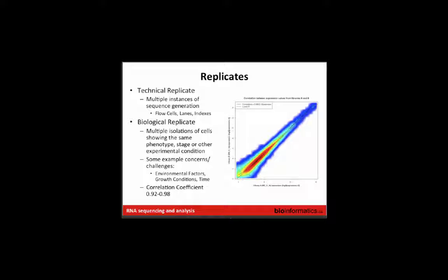Basically you have a piece of instrument data that is at most one lane or a part of a lane if there was indexing, and quality would get assessed on each of those pieces before they get merged into the final result. And sometimes it's not an issue. Depending on your experimental design, you may mostly just have one lane for each sample, but you definitely want to think about QC of the flow cell, the instrument, in case you don't realize that you're introducing batch effects to your project overall.